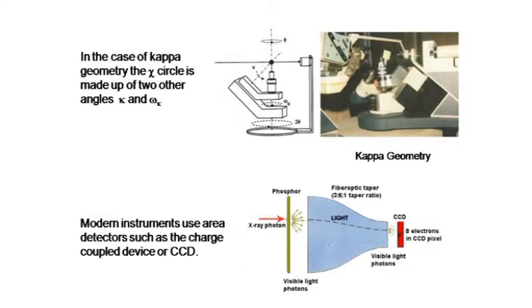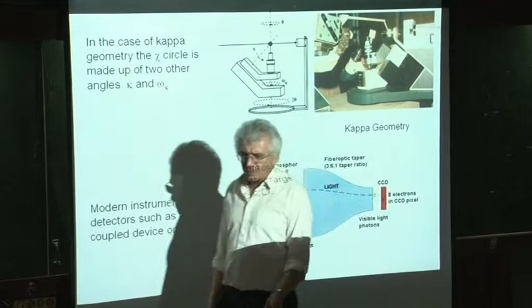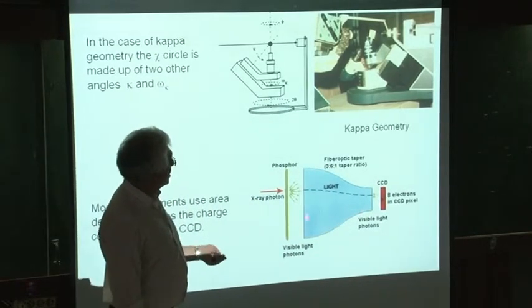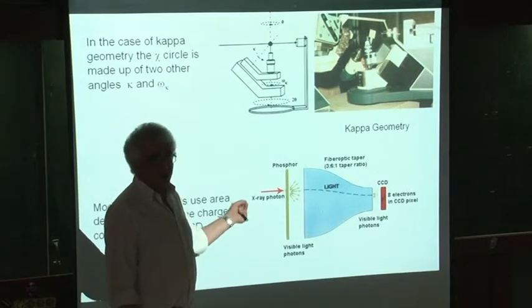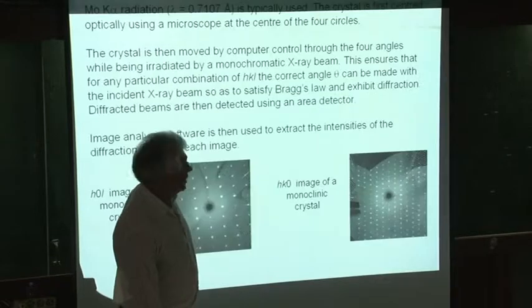And this essentially is a device for converting your X-ray photons into a digital signal. But it forms the basis of most CCD type devices today, and most diffractometers will come with a variation of this type of device, even powder diffractometers.